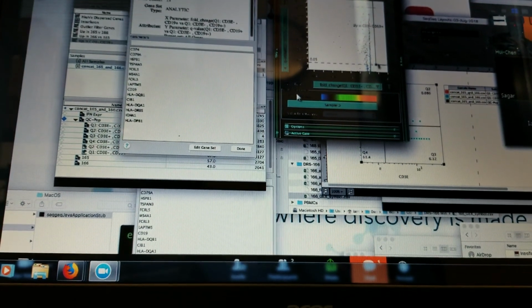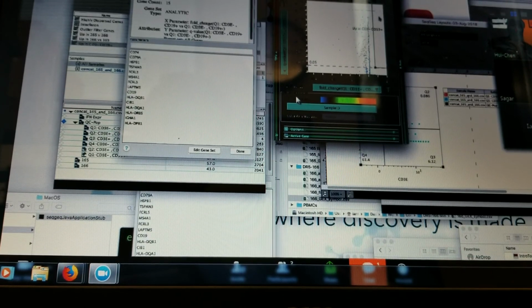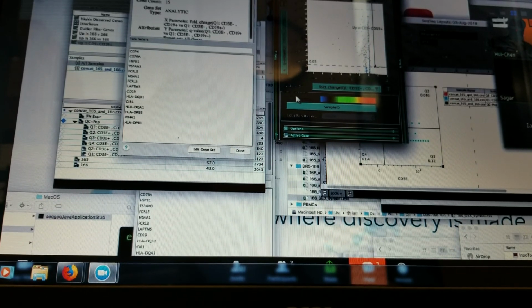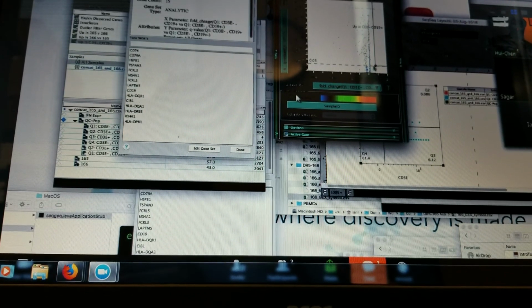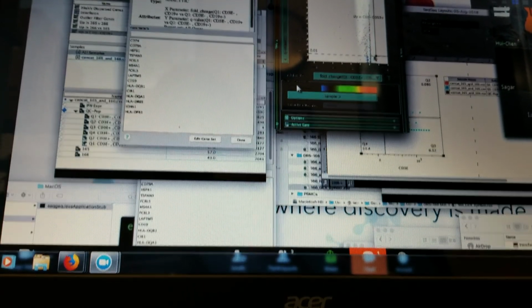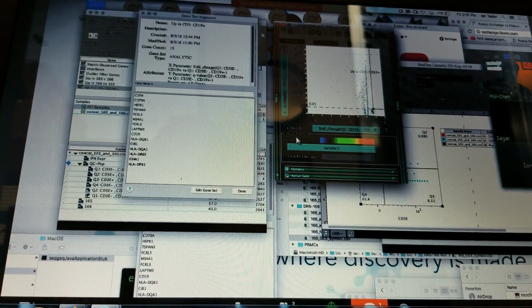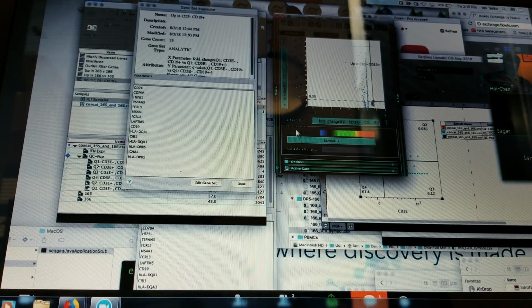All right. Yeah, usually I do twofold, but in this case, there's only really probably one gene, CD19, that's upregulated above twofold. So if I wanted to look at other genes that are upregulated, I had to move this over almost to 1.5, which I have seen researchers use as their upregulated threshold. Mm-hmm. Right. But it's up to the researcher really where they want to set that.